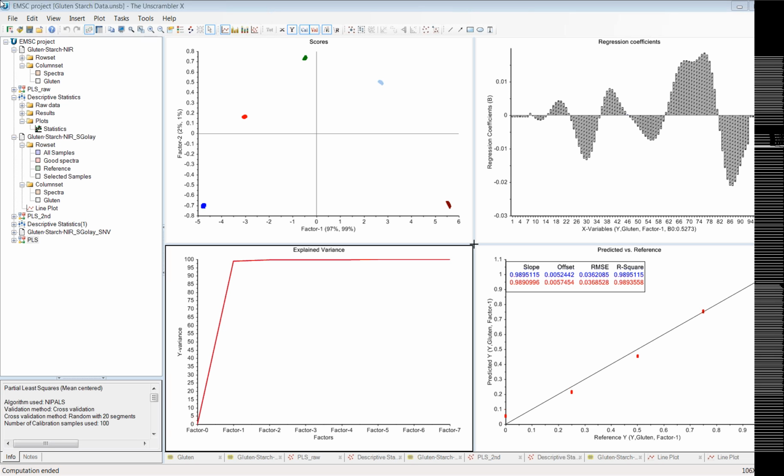One of the questions here is, if NIR is used to study the particle size effects of pharmaceutical blends, is there any special consideration for the pretreatment? Okay, now that's an interesting point. We tend to think of scattering effects as noise, but sometimes they're not, and that's a perfect example of when it's not noise. It's actually part of the structure that you're interested in, right? So how particle size will change the slope of your spectra, like we showed, I believe.